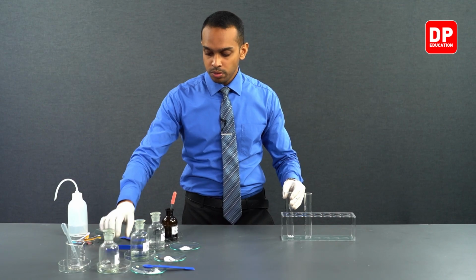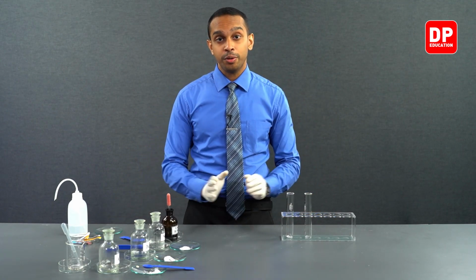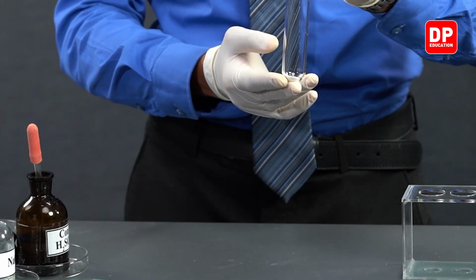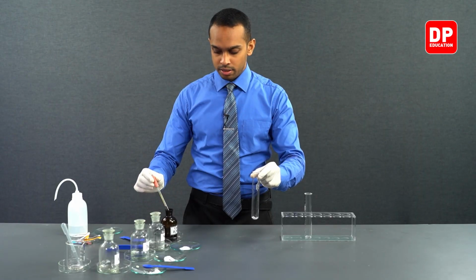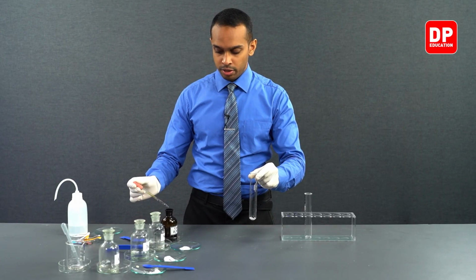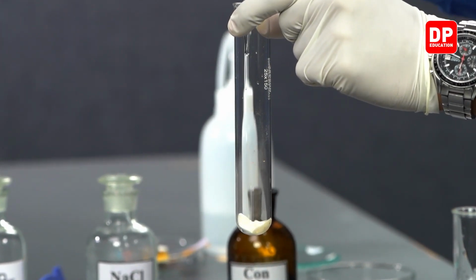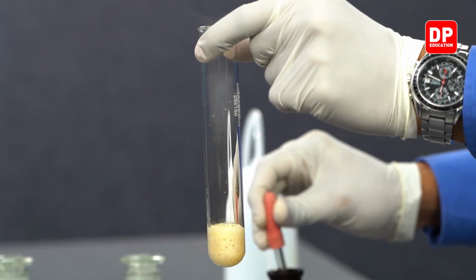And now let's add a little bit of concentrated sulfuric acid to this sodium bromide solid. Let me take a little bit of concentrated sulfuric acid and add it into the sodium bromide solid.